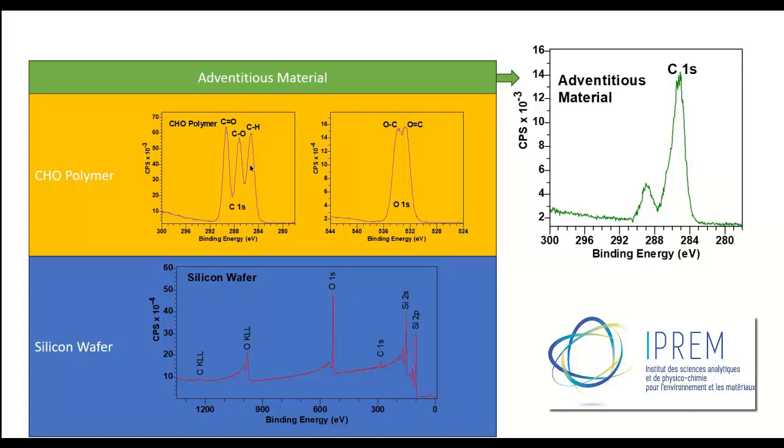We see a number of chemical states in both the carbon and the oxygen. And this is what we would normally focus on when we're doing XPS. But the silicon wafer does have an influence on XPS spectra, and I can illustrate that using a very simple test using principal component analysis.